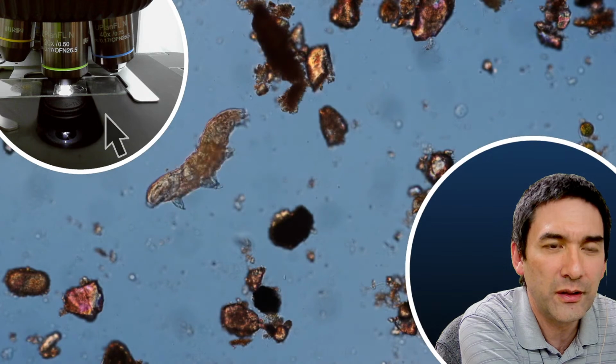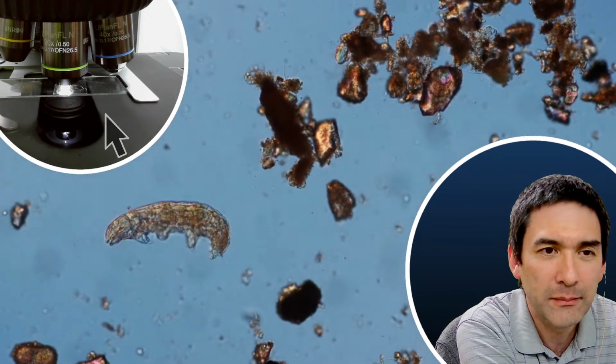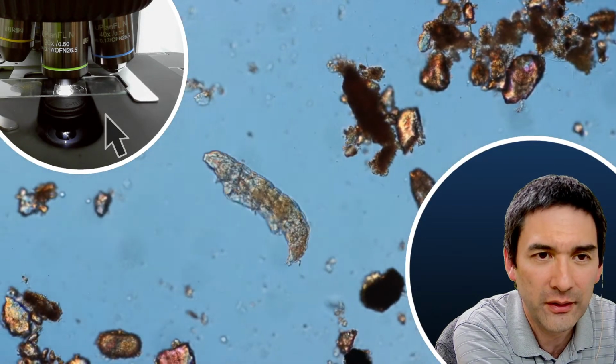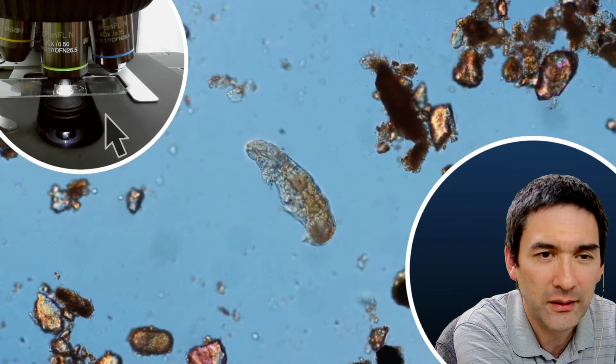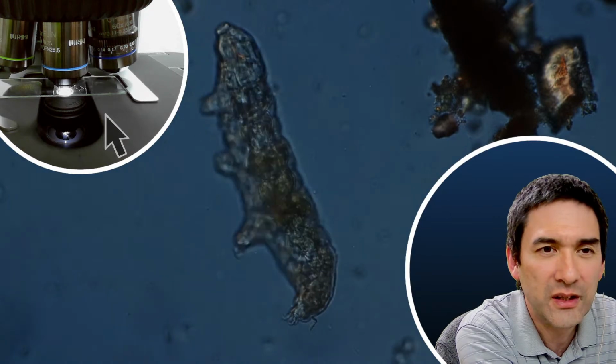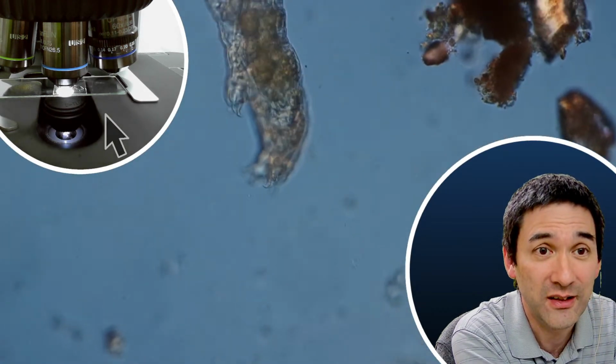Of course, electron microscopy is cool, but light microscopy has the advantage that you're able to see movement. But of course, the details of electron microscopy are fascinating as well.